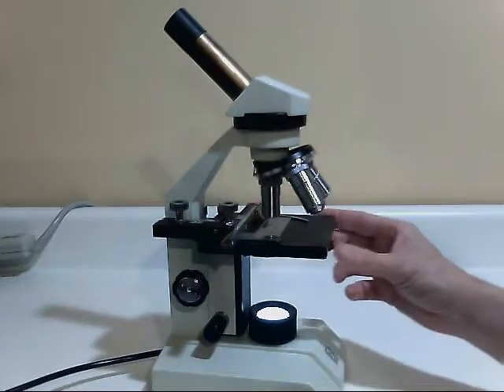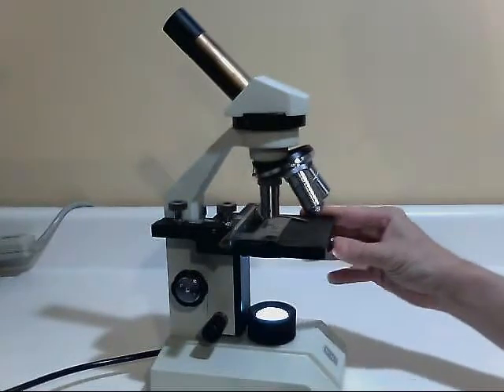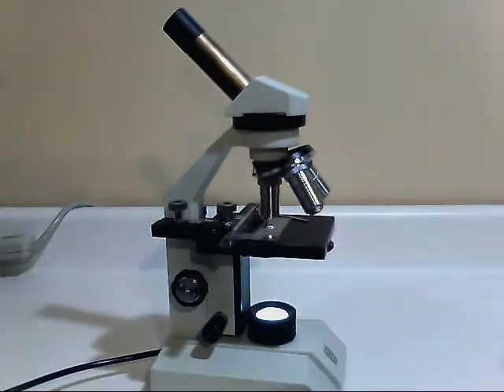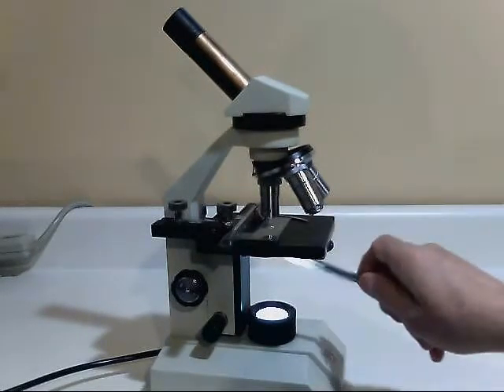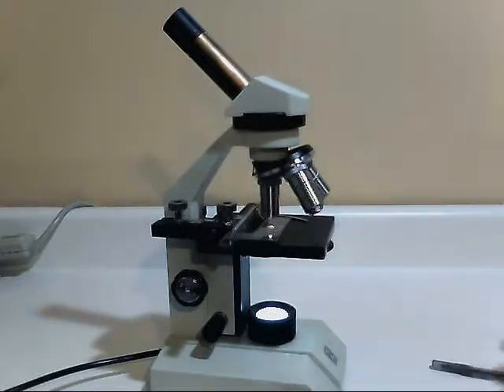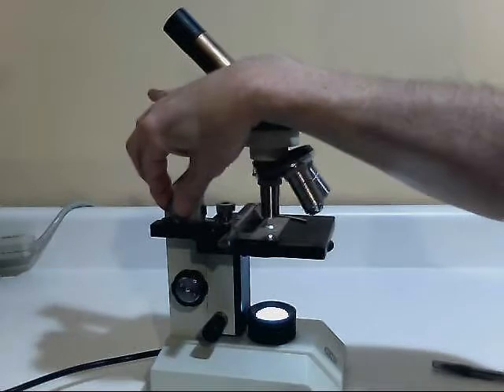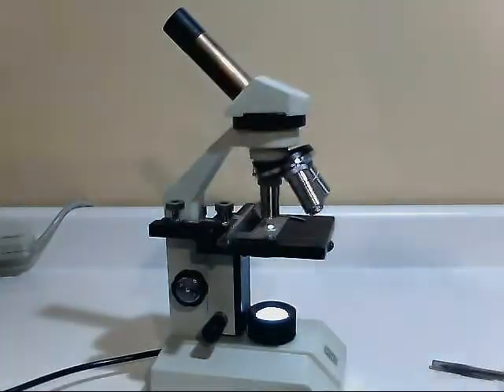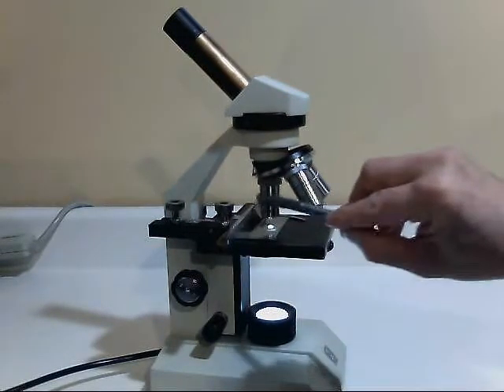Some microscopes have an adjustment for the amount of light that they let through. And you may not be able to see this, but if you look where the slide is, you'll see some light coming through the slide. You can use that as an estimate for adjusting the specimen and getting it lined up so most of it's in the light, which means most of it's going to go through the objective lens.